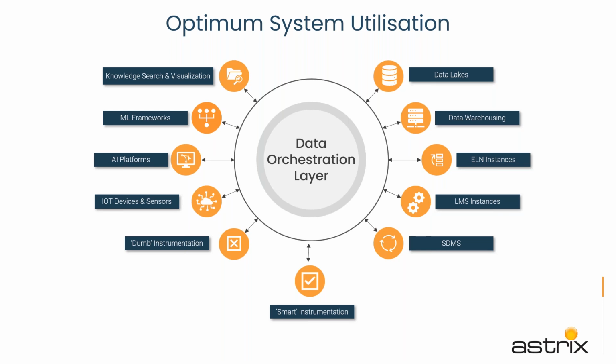Each had their own ecosystem of point-to-point connected instruments. They had their own ecosystem of data sources and devices, and now they're looking to get a handle on all of the data so that they can leverage generative AI technologies and try to gain insights based on the data that they're working with across those different systems. So the current trend when we look at how people are trying to solve this is via data orchestration. So these are technologies such as your Zontals, your Cyteras, your TetraSciences, or even your L7s. And there's also a few more in the mix there as well.